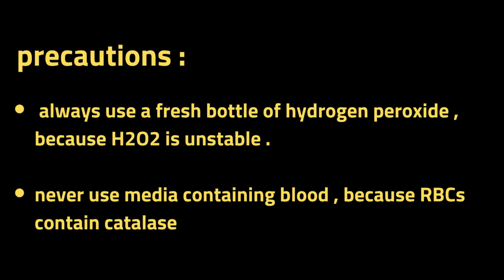Precautions. Always use a fresh bottle of hydrogen peroxide, because hydrogen peroxide is unstable. Never use media containing blood, because RBCs contain catalase.